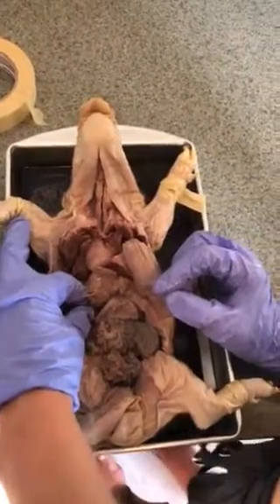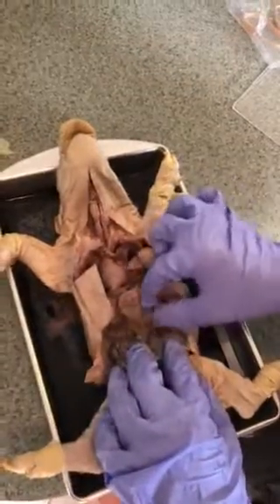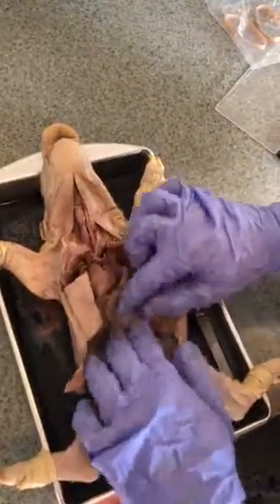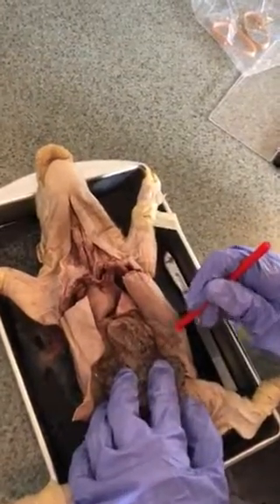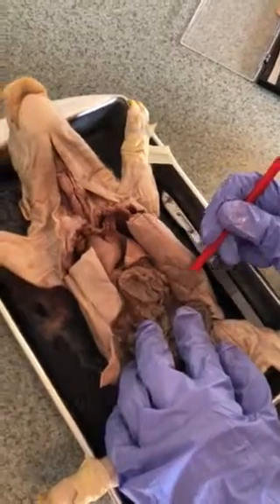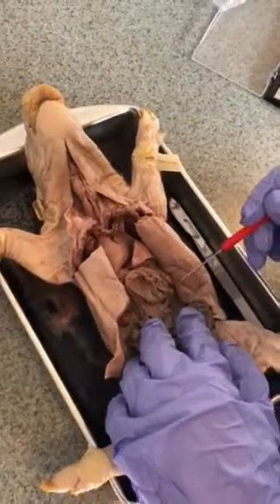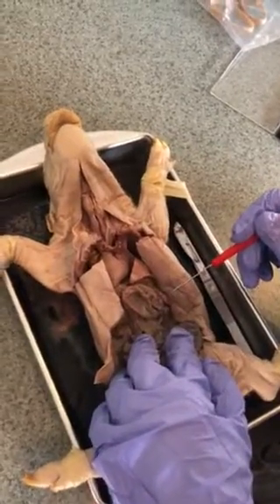We have the pancreas, which is going to be behind the stomach, underneath the spleen, and you can kind of see it here. It kind of looks like cauliflower back here. That's the pancreas. We did the right atrium, the right lung, right ventricle.